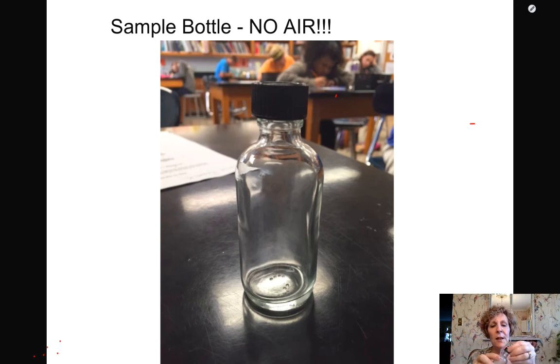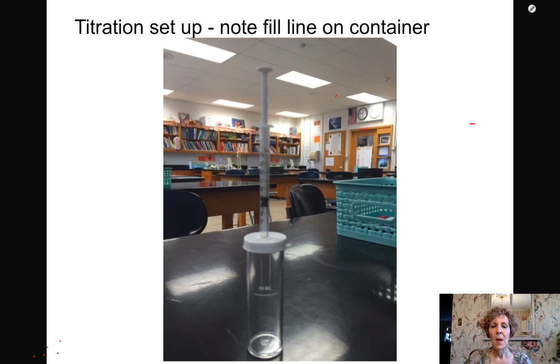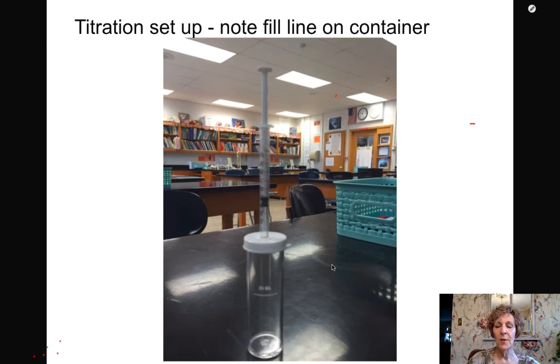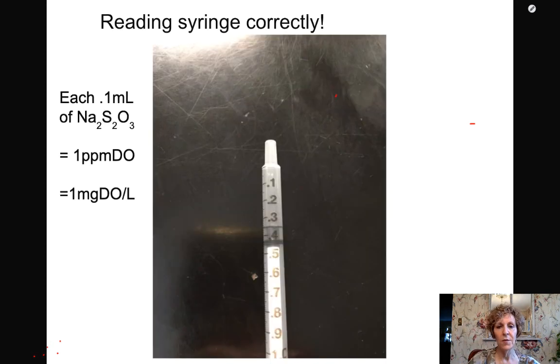So when you put the lid on, liquid comes gushing out, because you don't want any air in your sample bottle. And notice the fill line on the container here. You definitely want to fill your sample after you add your chemicals in the Winkler method. That's going to be your fill.